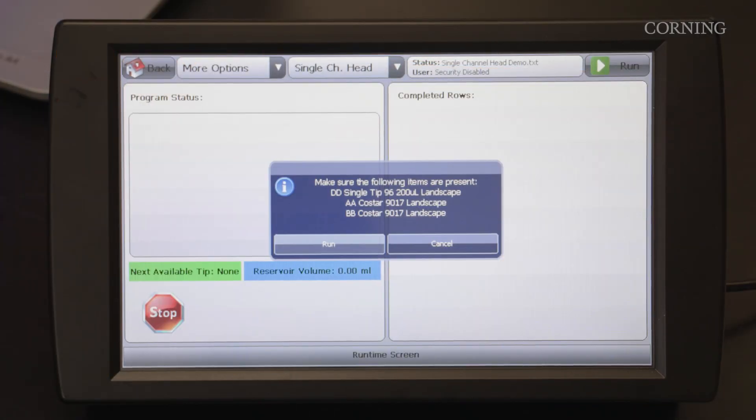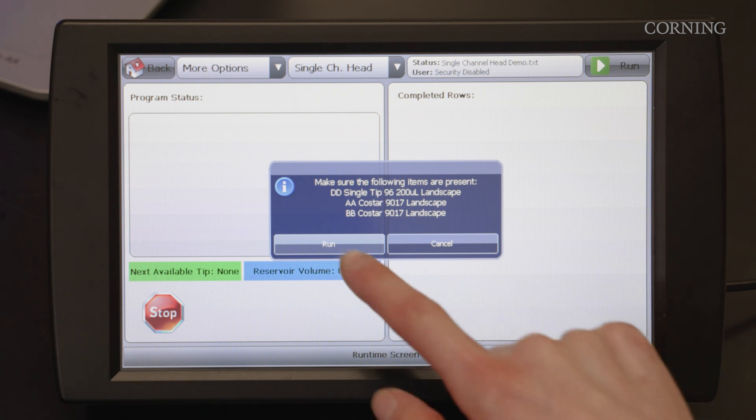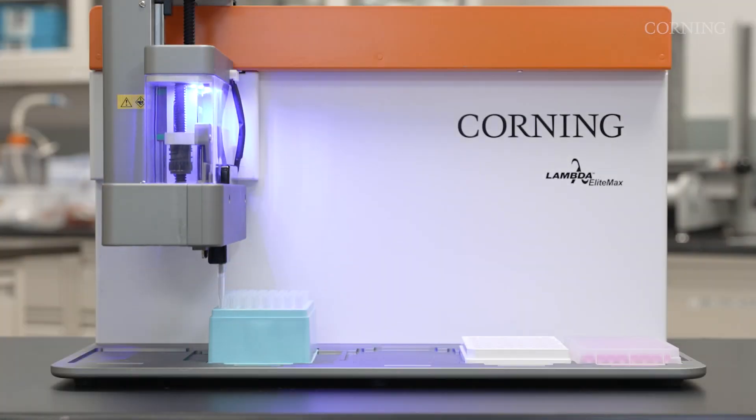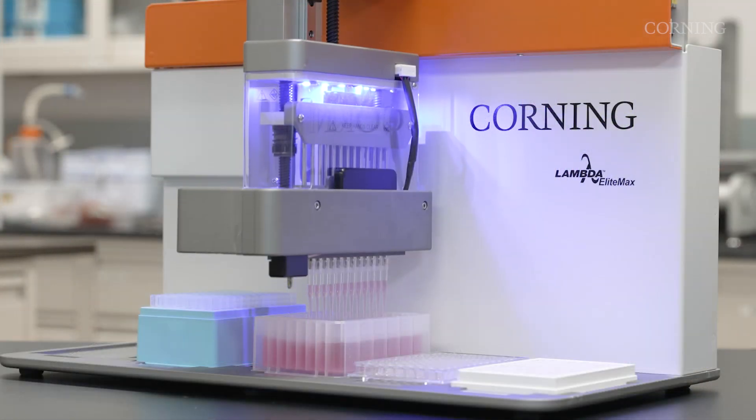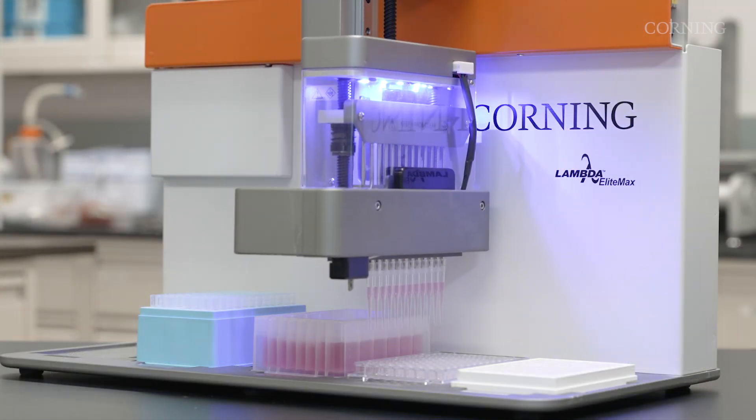Once the methods are programmed into the unit with a push of a button, the workflow operations begin with the ability to pipette using both the single and 12-channel head interchangeably without additional intervention.